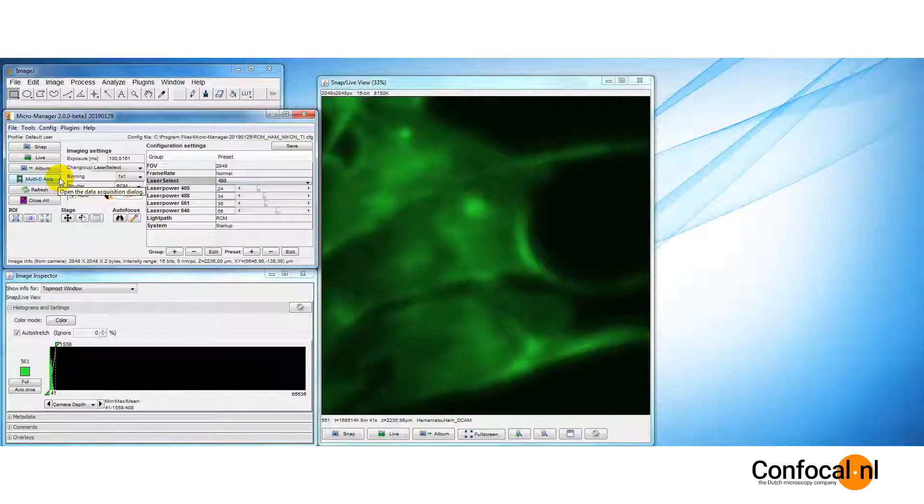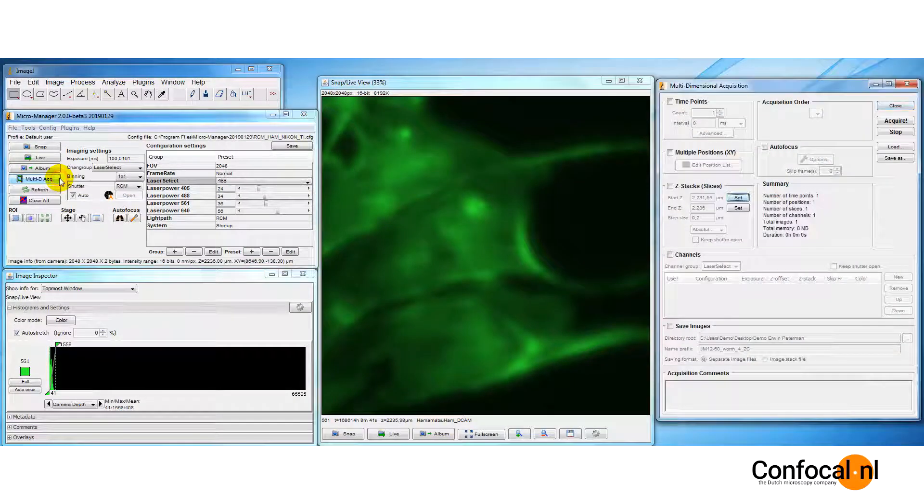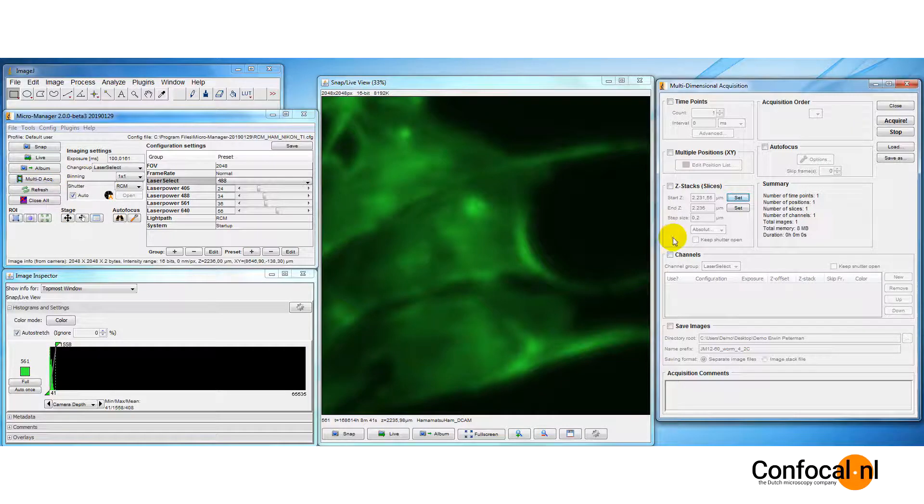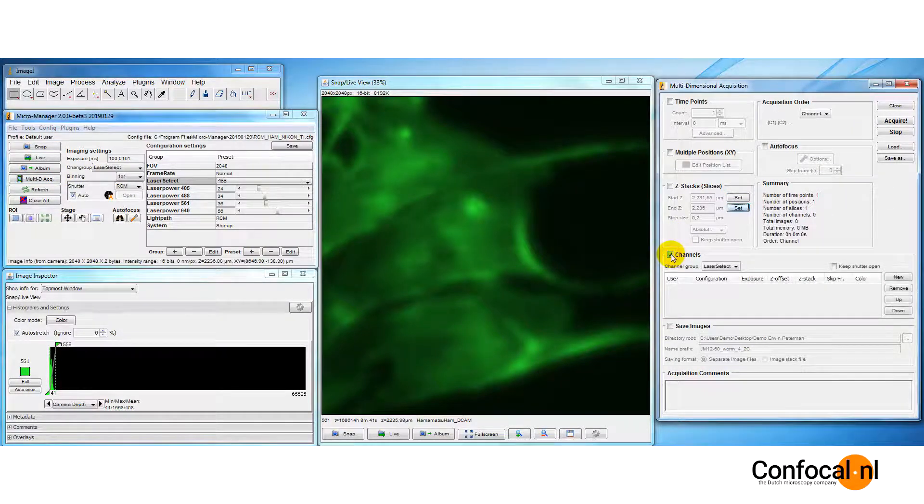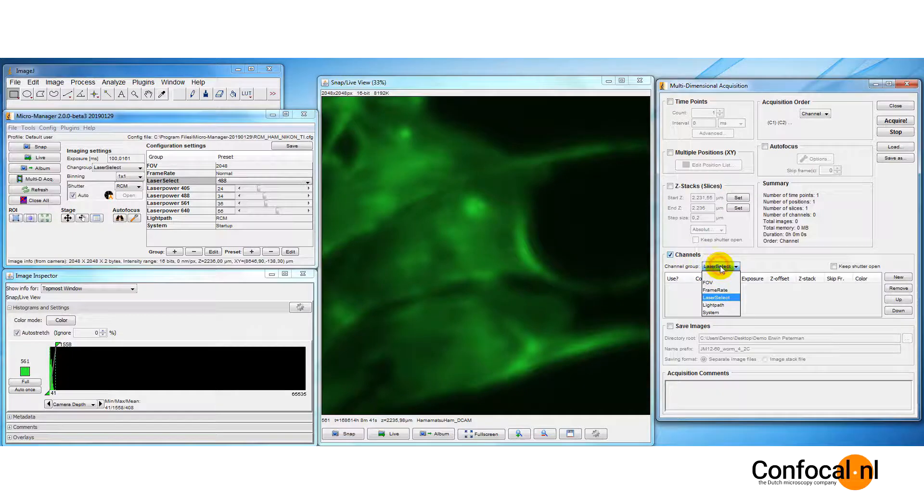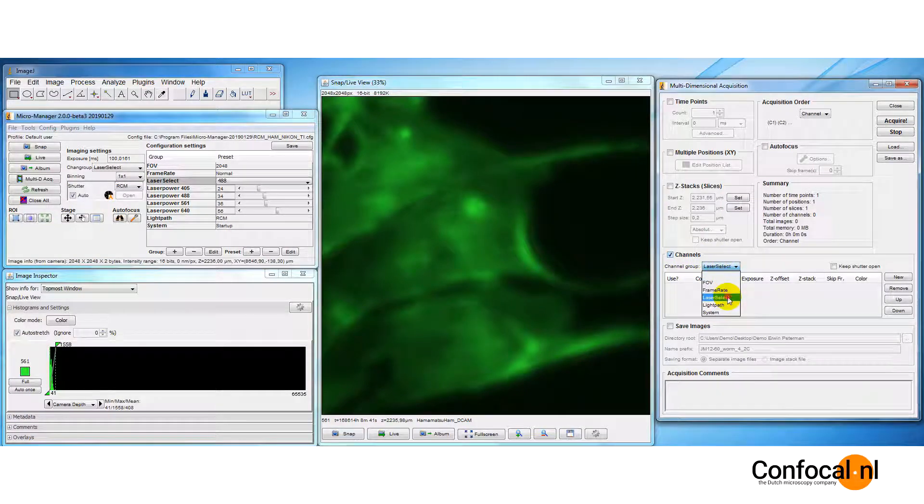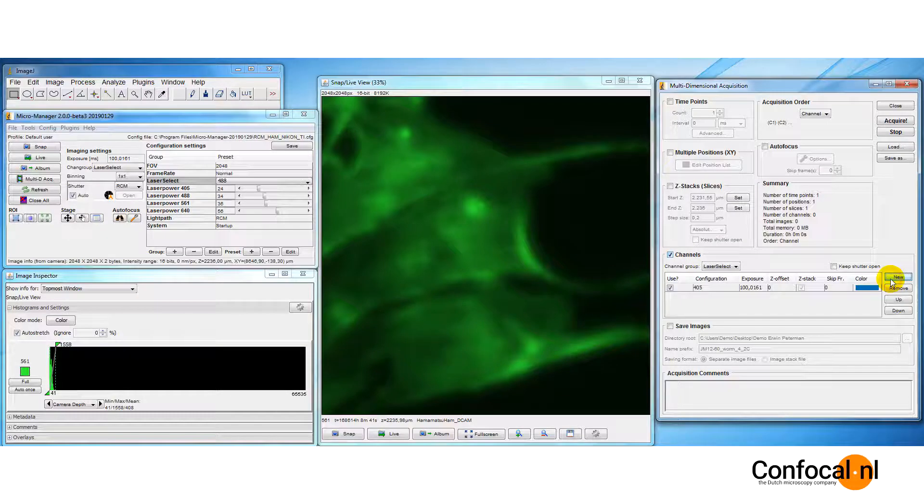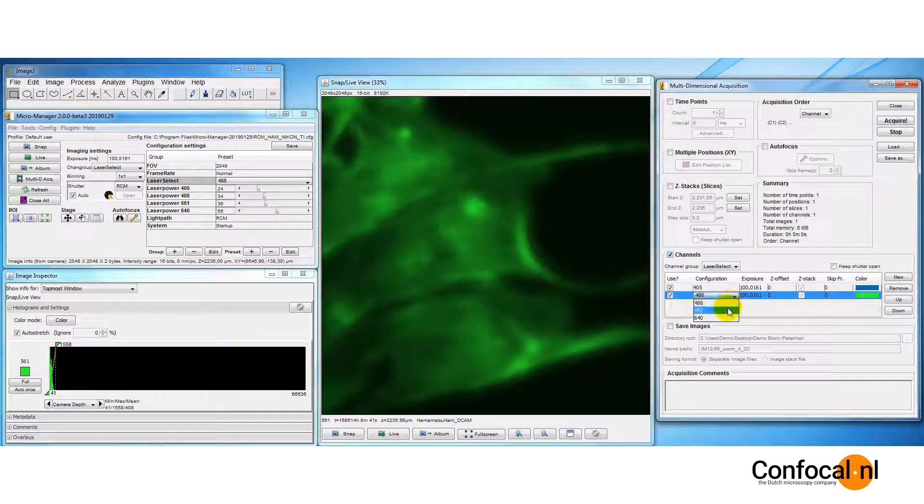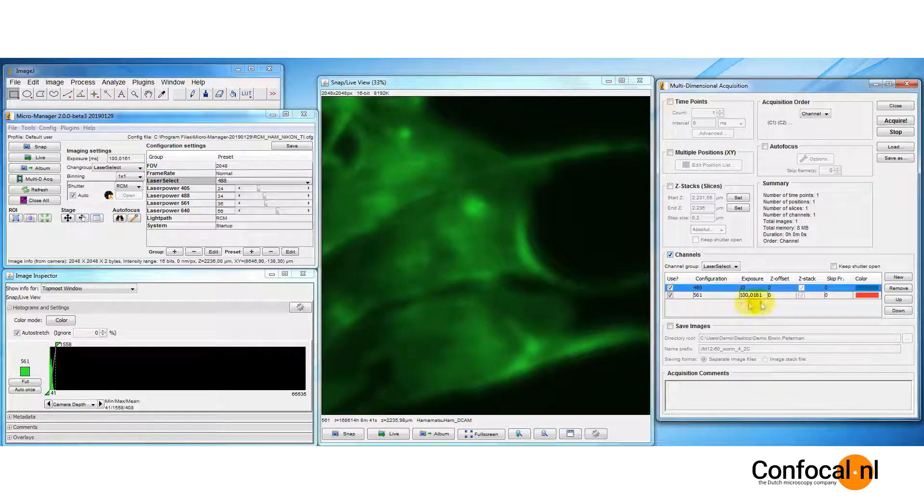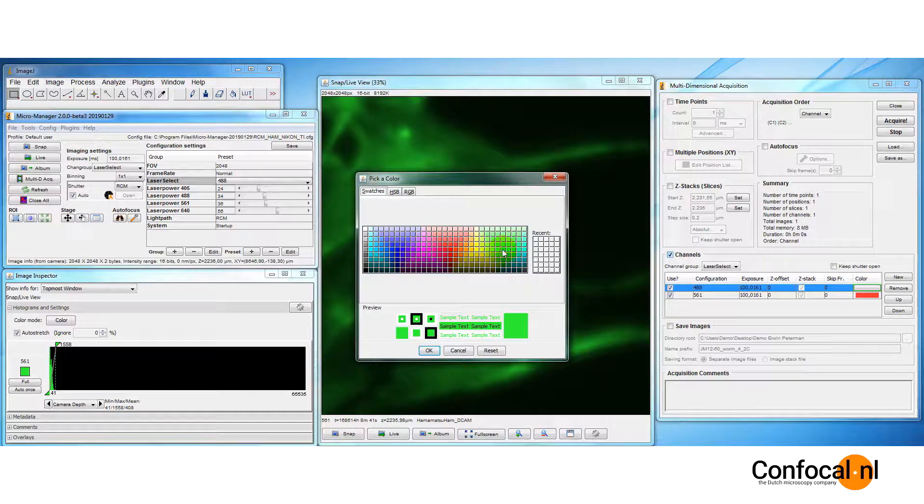Let's perform a multi-channel experiment. Activate channel in the multi-dimensional acquisition window. From the channel group drop-down menu, choose channel. Press new to add a channel. You may choose to change the order in which the channels are taken using the drop-down menu from the configuration column. You can assign colors by pressing the colored icon in the color column.